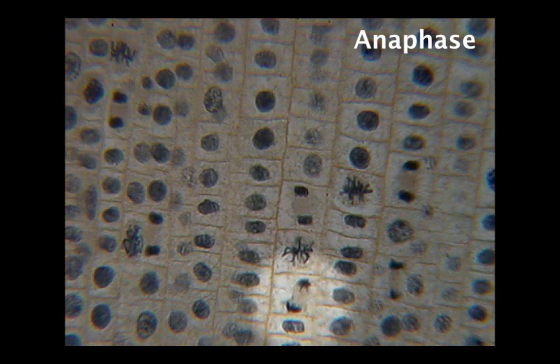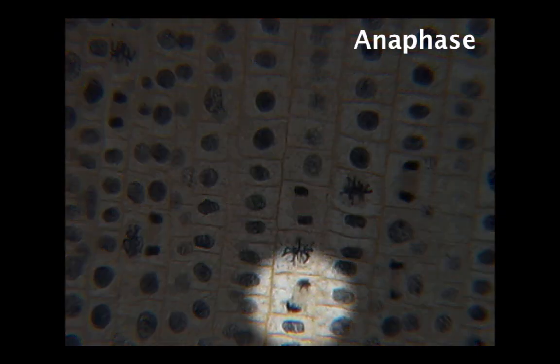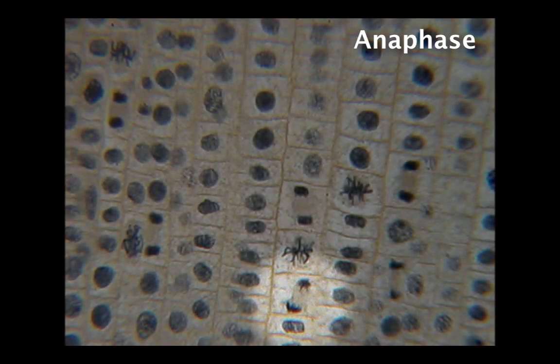This cell at the bottom in the center is clearly in anaphase. The sister chromatids are being pulled to opposite poles of the cell, and the separation is clear.